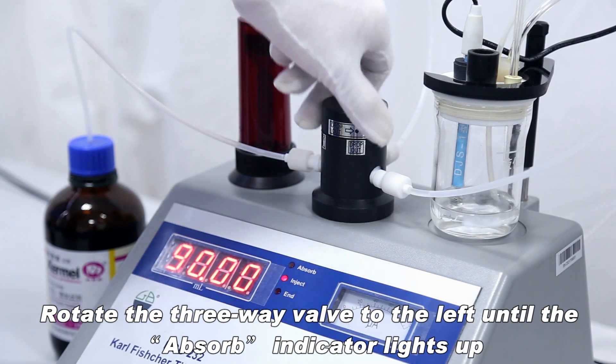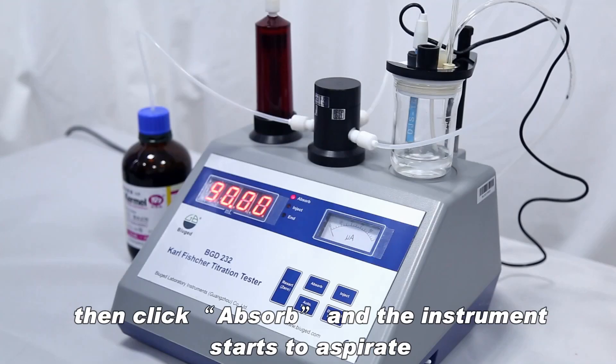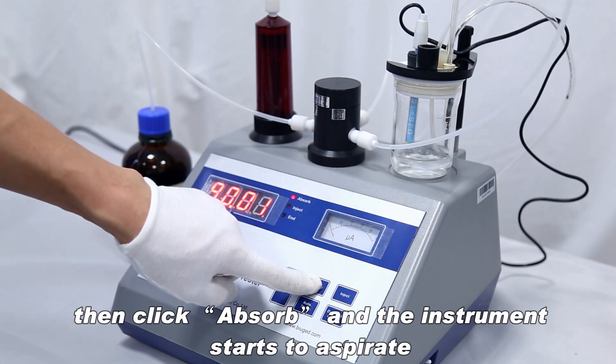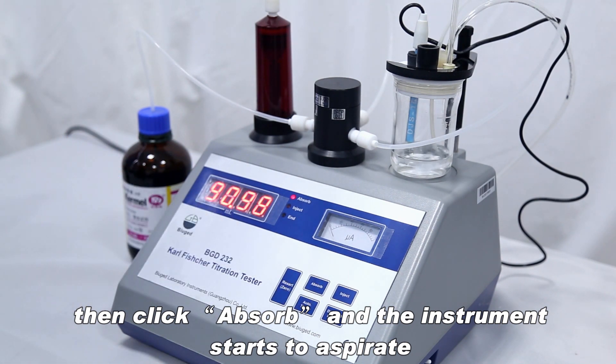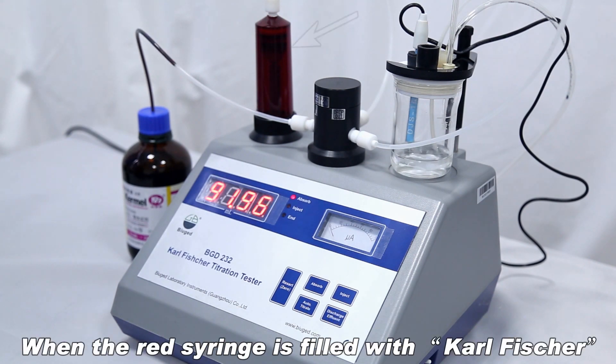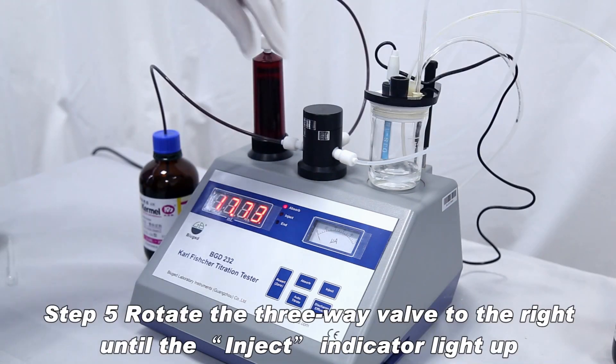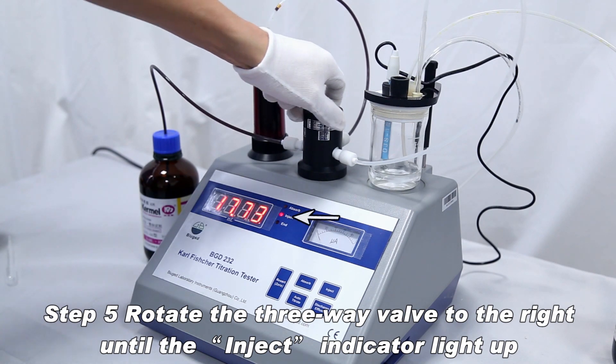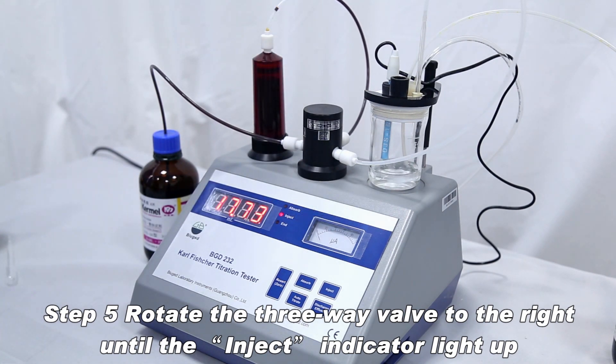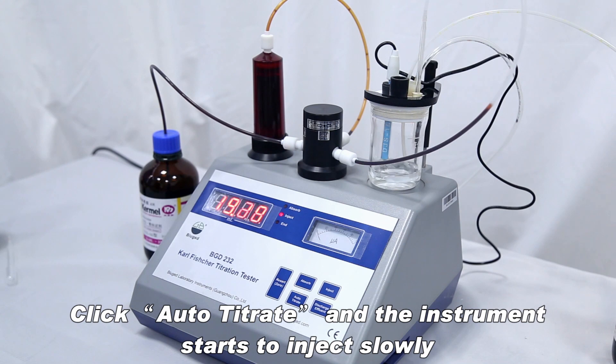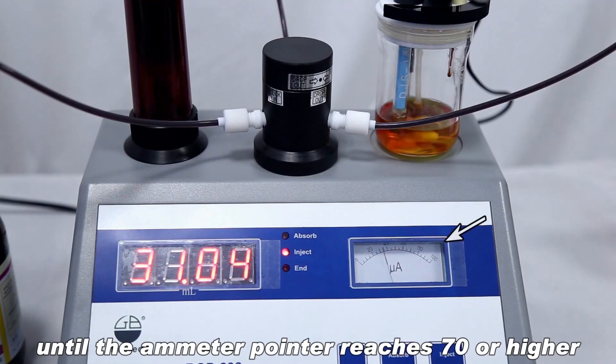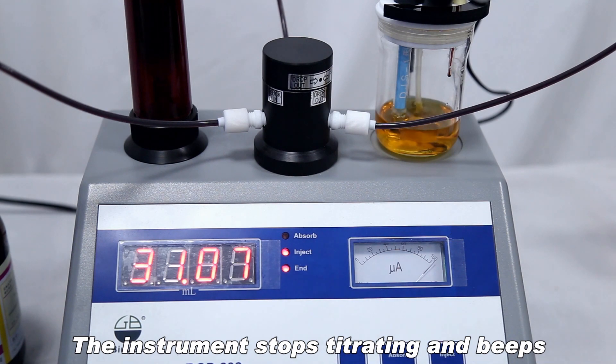Rotate the 3-way valve to the left until the absorb indicator lights up. Then click absorb and the instrument starts to aspirate. When the red syringe is filled with Karl Fischer it stops automatically. Rotate the 3-way valve to the right until the inject indicator lights up. Click auto-titrate and the instrument starts to inject slowly. Until the ammeter pointer reaches 70 or higher, the instrument stops titrating and beeps.